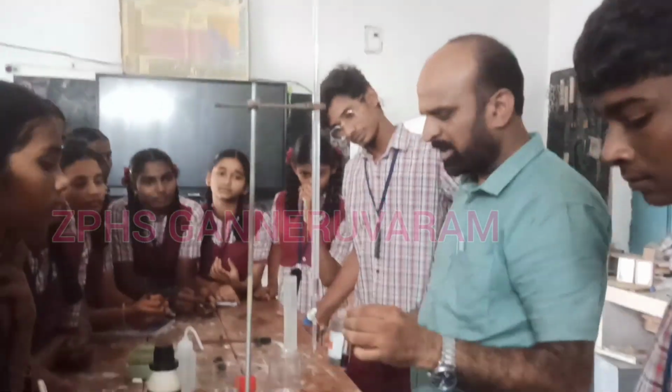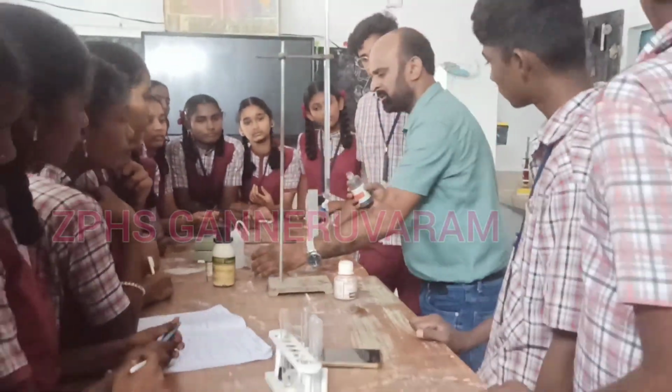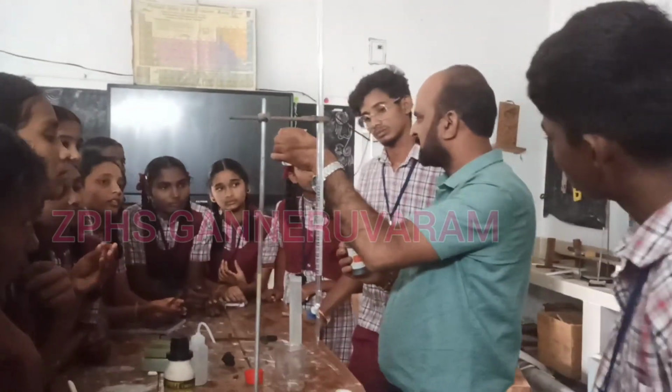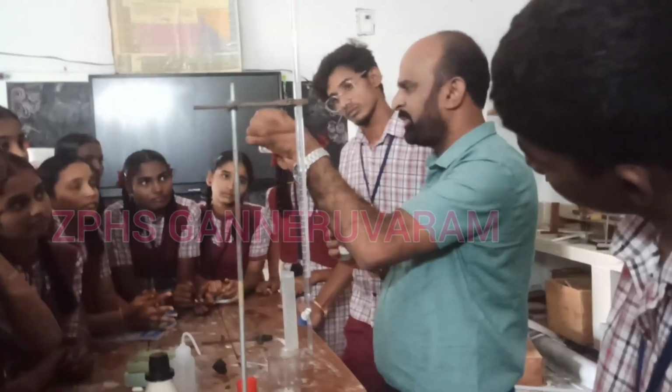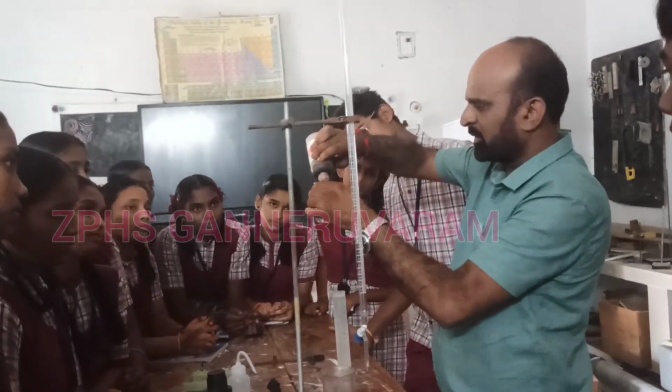Whenever this red litmus is added to the basic solution, sodium hydroxide solution, this is taken in the beaker.